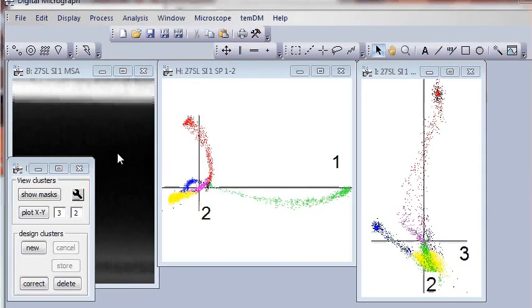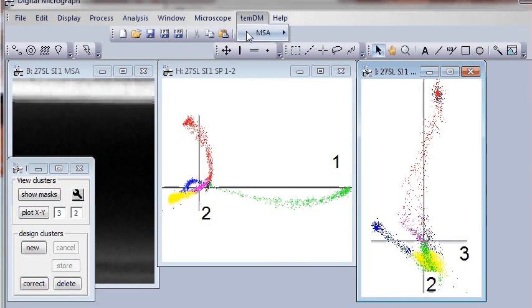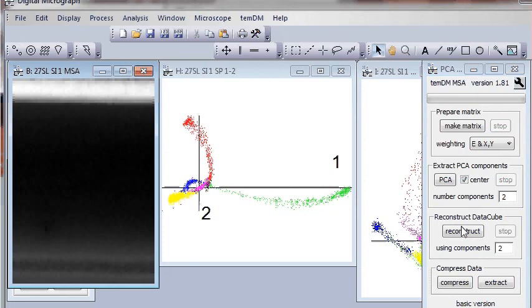Well, I think it was an adventure. We explored the structure of our data in some three-dimensional energy space. You can try even more dimensionality, but I think it would be a challenge. I have to mention that all these clusters can be treated by PCA as a package if you press PCA here. And you also can extract the average spectrum for each cluster.